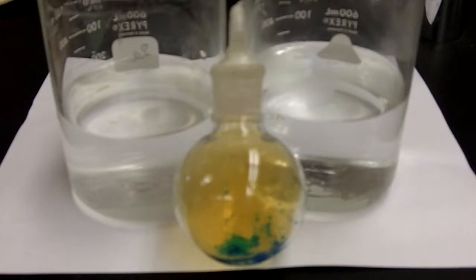In equilibrium B with sodium chloride, we have the equilibrium between solid sodium chloride and aqueous sodium chloride in a saturated solution. Noting that NaCl(aq) is equal to Na+ and Cl-, both aqueous and separate from one another in solution. In equilibrium C, 2NO2 is in equilibrium with N2O4. For that one, we're starting with that one.